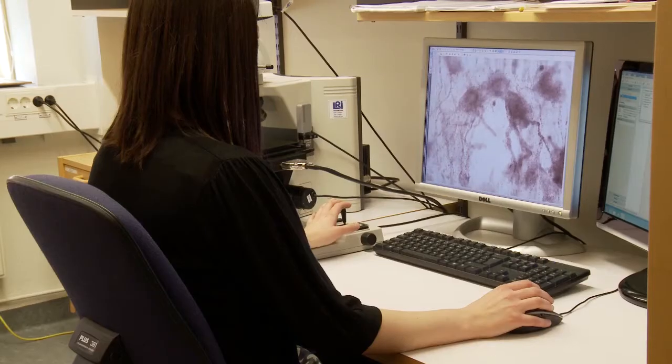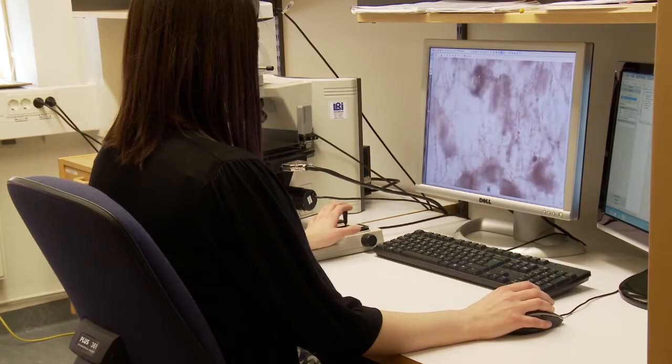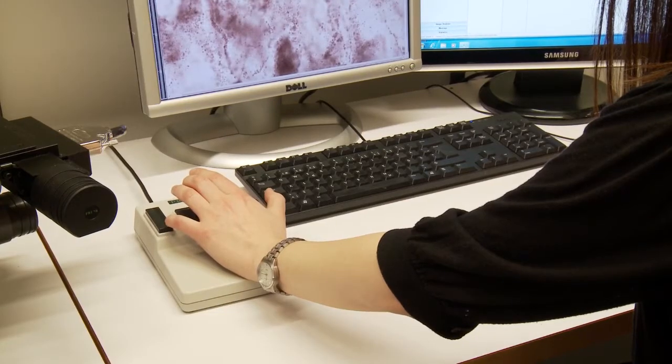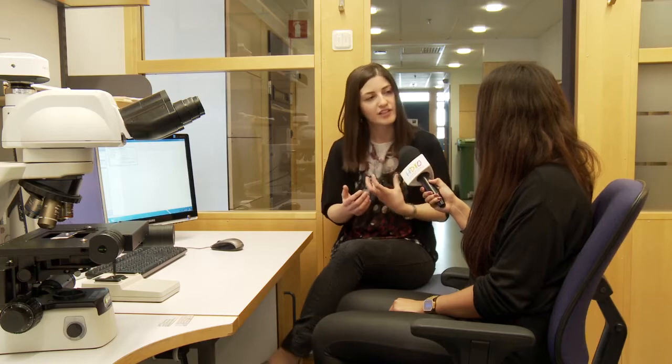Rana, can you tell me what you're doing here? Yeah. Here we are using this computerized microscope to count the number of cells in the brain. Okay. Why is it so important to count them? It's important because we want to look at the structural changes and changes in the cell populations in the brain. And to be able to do that, we need to get quantitative data.